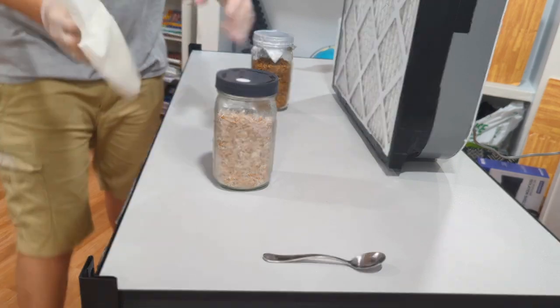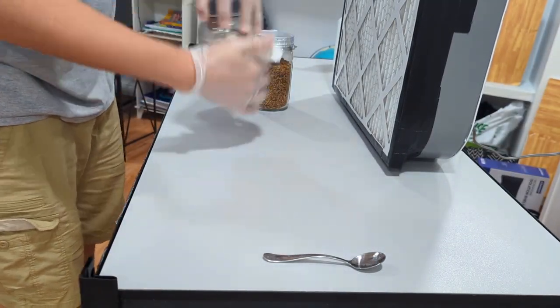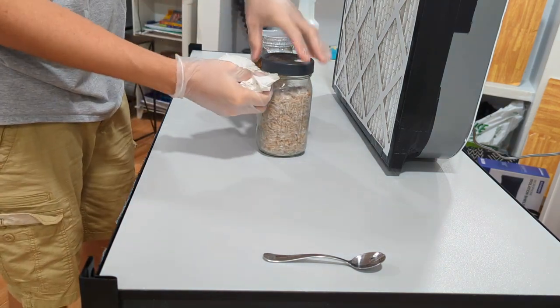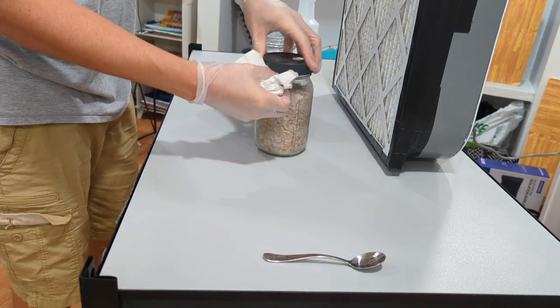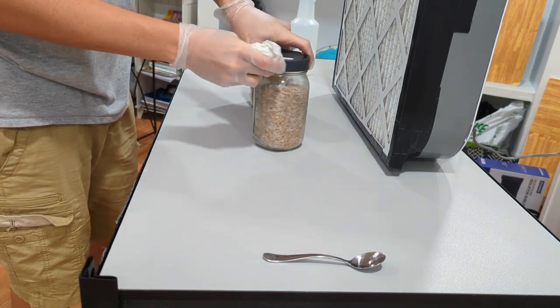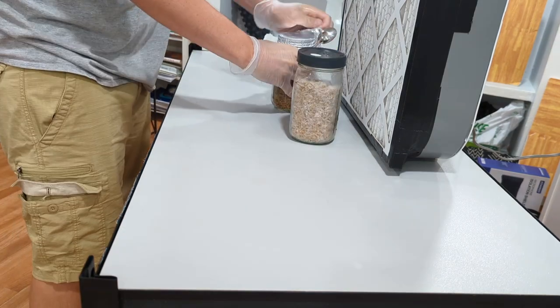You're going to want to wipe down your master jar very well — that's your colonized grain spawn — with 70% isopropyl alcohol. Get in the crevice here because there's a lot of dust that accumulates in this spot. I would even spray it with a spray bottle with 70% iso, just wipe it good.